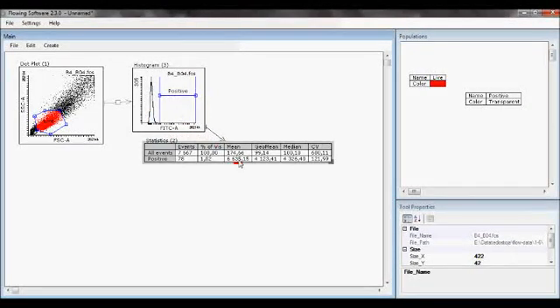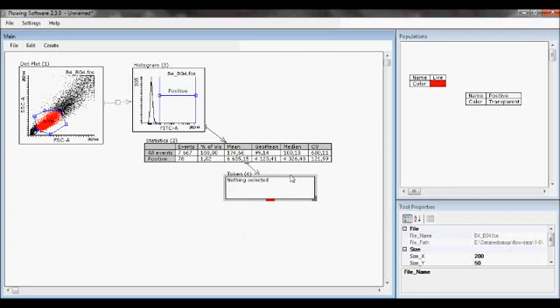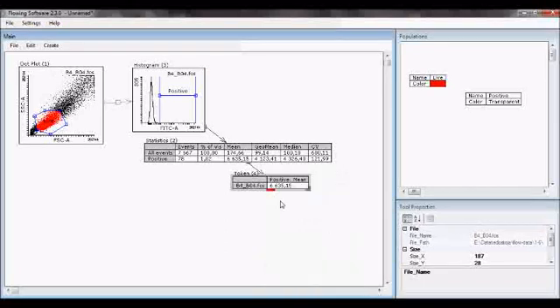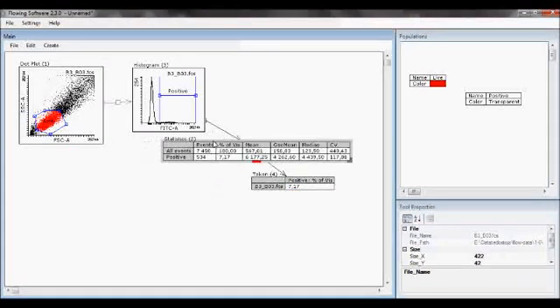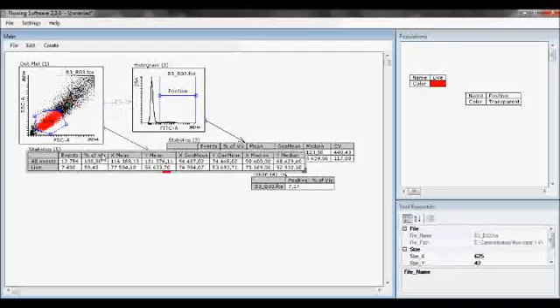Next statistical collection tool is called token. This is a little bit different. This is just a value holder. Itself it's very boring, but it has several benefits. You can select quite similarly as in the stat list. You can select a number, but only one number. It holds only one number, and when the file is changing, it just holds the one number from one file. Boring. But when combined with other tools, it's quite powerful.